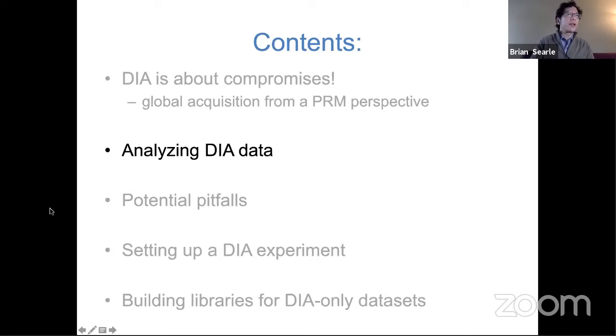So there's another question, DIA versus DDA. In this particular case, I would vote for DIA. For these types of experiments, if I am interested in doing a detection experiment where I've only got a single sample or a handful of samples, and I just want to do a spot check, I'll typically do a DDA experiment. But if I want to do a quantitative experiment, I will much more prefer to do a DIA experiment than a DDA experiment, unless the sample has very low complexity and the things I'm interested in measuring are relatively high intensity in that matrix. Okay.